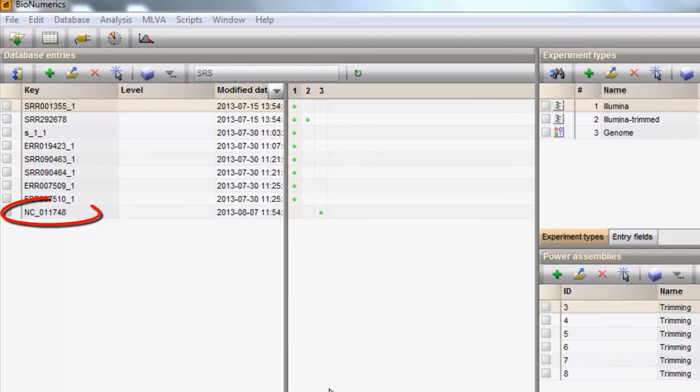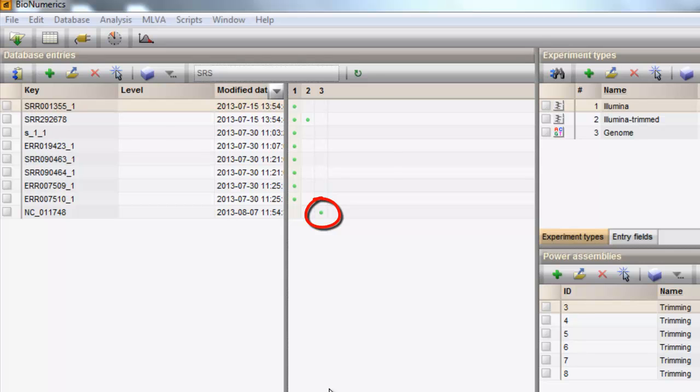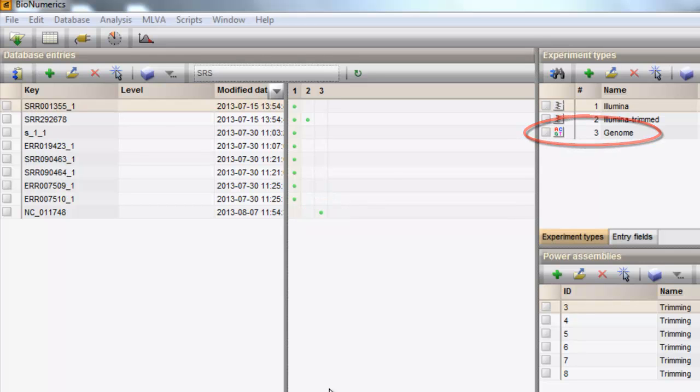This last entry holds the metadata on this reference sequence, and the sequence itself is saved to the genome experiment present in the database.